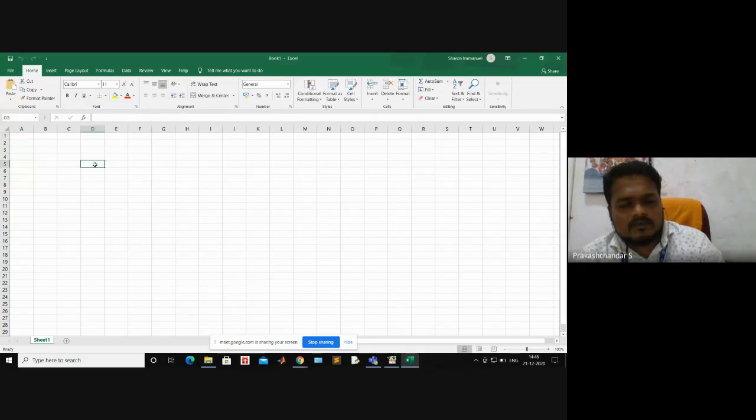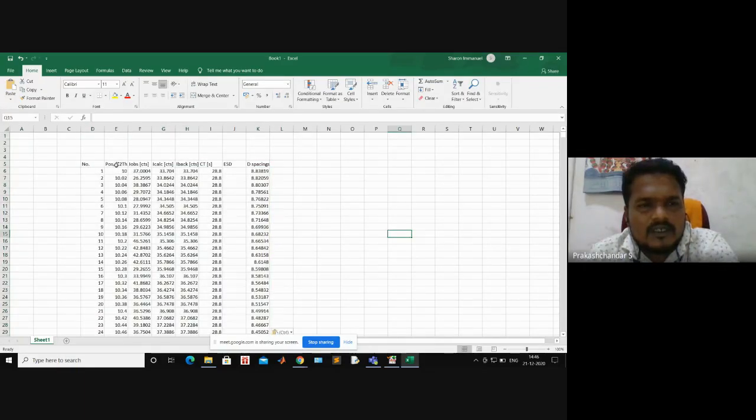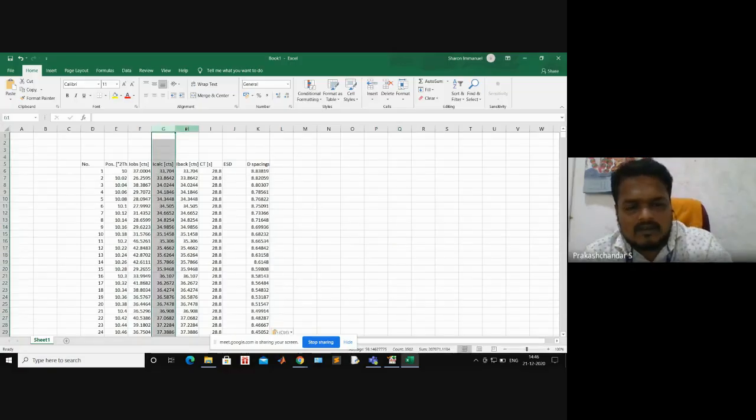Make it here. But we need only the 2 theta and this one. So the remaining you can delete.